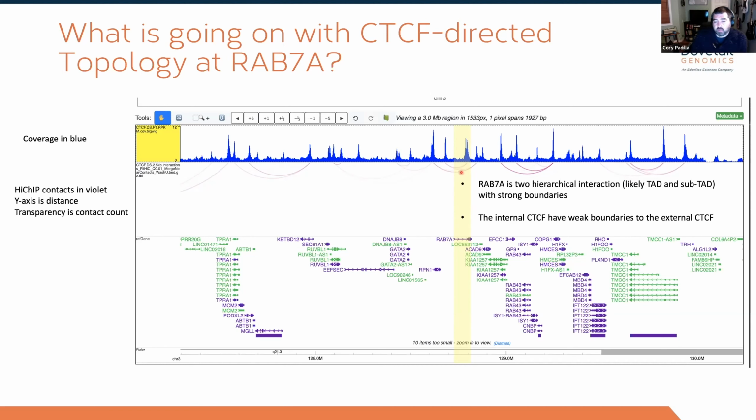And one of the things that is really interesting here is that there is a hypothesis out there that H3K4 trimethyl actually directs Pol II to read in certain directions. So the directionality of how these contacts go in the matrix is informative of the biology. It's nice to have a p-value on them, but if you're just plotting the arc, you're going to miss some of that subtlety. It is almost a little bit of an art form, and you need a lot of supporting data to make those claims. But you boil it down to a p-value, and now bring that p-value back to the larger picture of what this protein-directed topology can be doing, which I think is the more fun question to ask after you get the p-value.